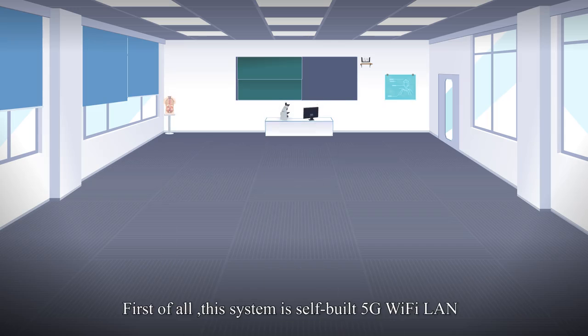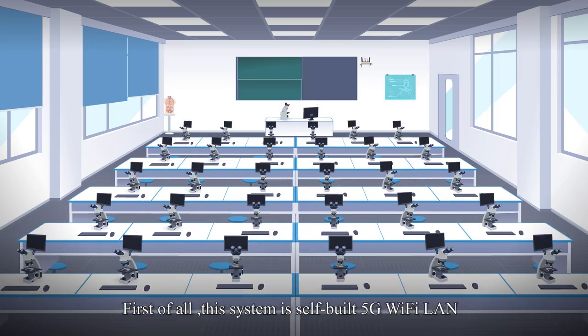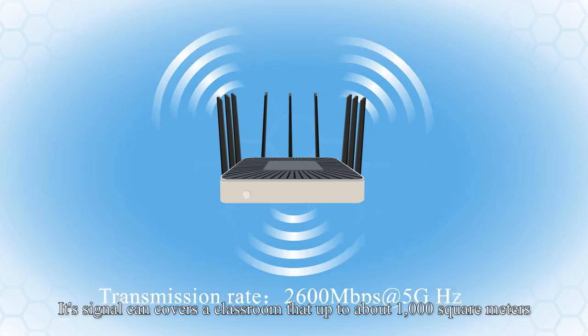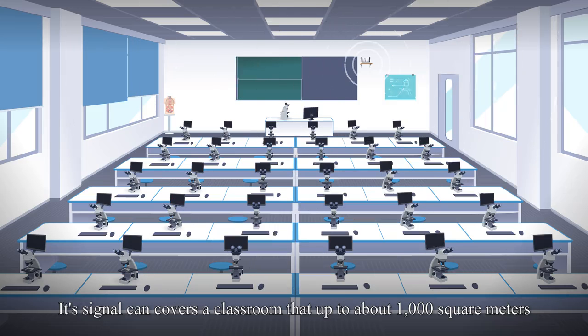First of all, this system is self-built 5G Wi-Fi LAN with high-speed data transmission. Its signal can cover a classroom up to about 1,000 square meters.